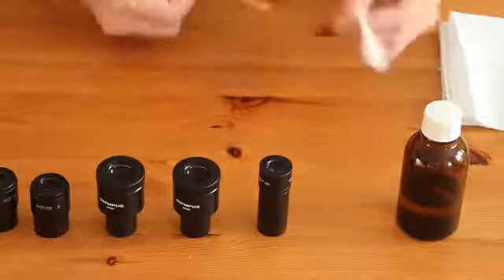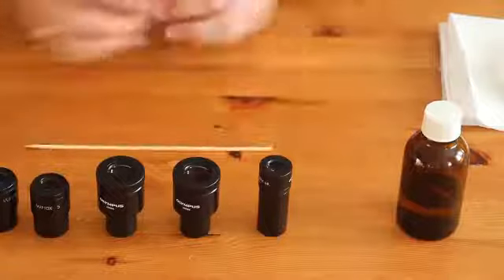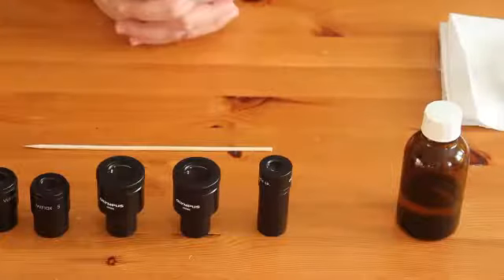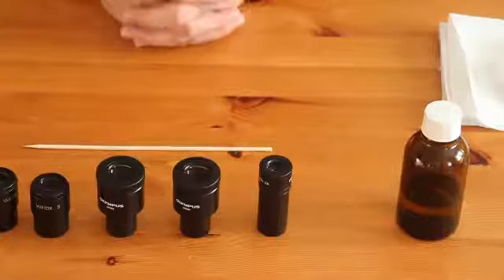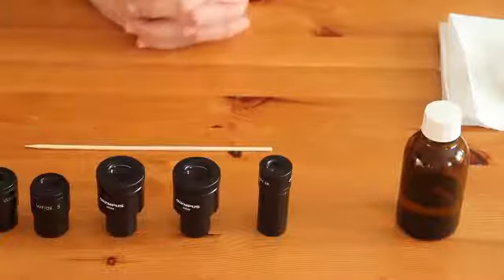This was basically a short introduction on how I clean my eyepieces. The next time I'm going to have a look at the rest of the microscope. Wish you all the best.